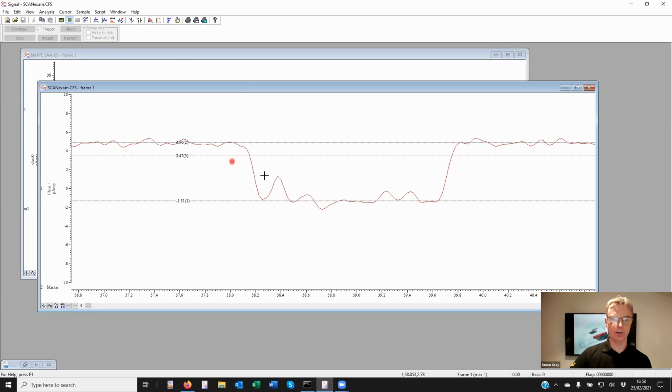Looking at this data, there's a short closing here, which is too short to meet the threshold if you just use a simple threshold crossing, so it will go undetected. The scan analysis can actually pick that up. There's lots of scope for an hour's talk on how to do this sort of thing coming up in a few weeks' time, if that's something you're interested in. Okay, we'll take some more questions if anybody has any.